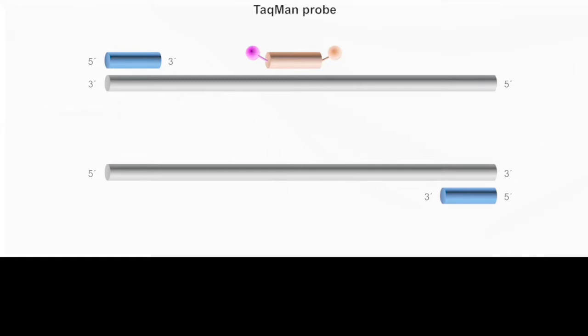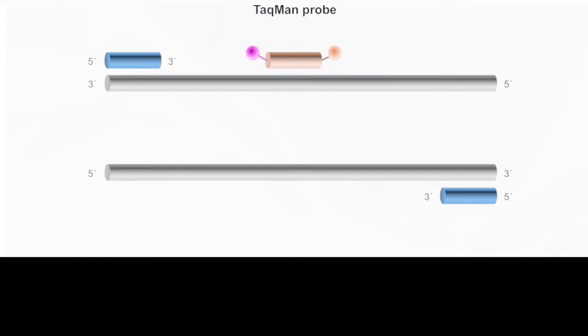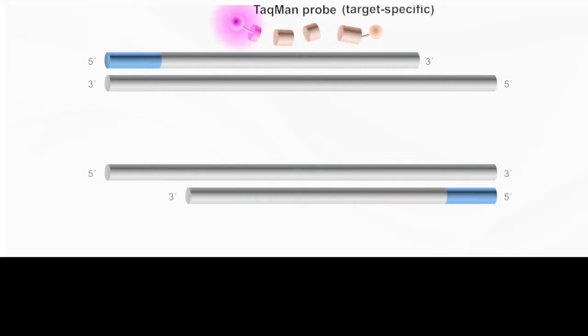And so this means that if you are using a specific probe in your qPCR reaction, you design not just the forward and reverse primers, but you also design the fluorescent molecule to bind specifically to a region of the region you are wanting to amplify. And then a quencher is incorporated to regulate the fluorescence while it is not part of that PCR reaction.